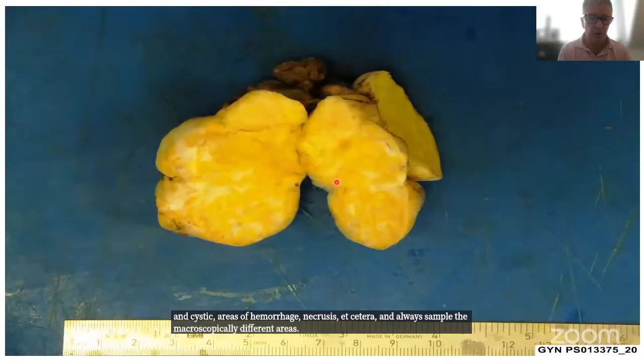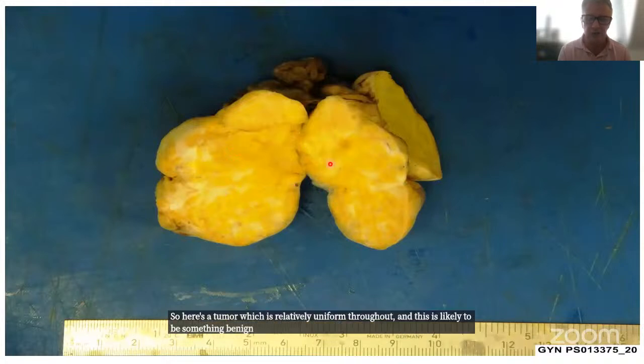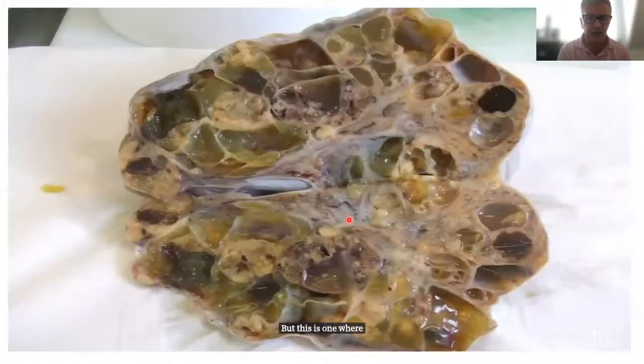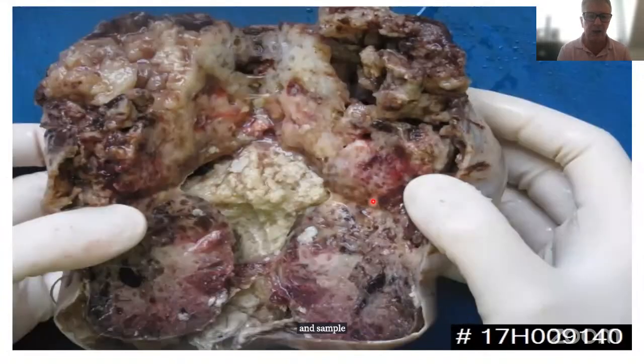So here's a tumor which is relatively uniform throughout, and this is likely to be something benign, so you maybe don't need so many blocks. But this is one where there are solid and cystic areas, lots of different areas, so you need to describe these and sample all the different areas well.